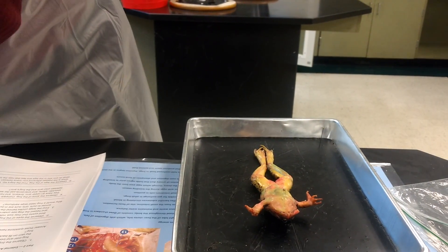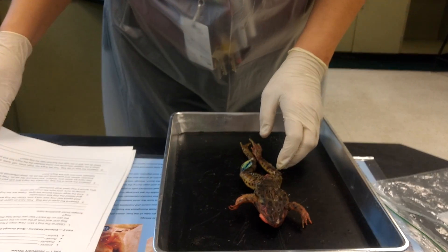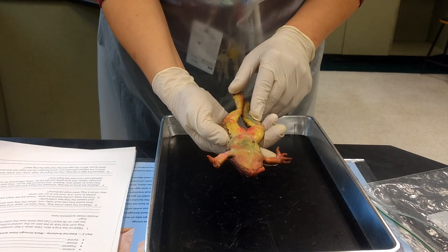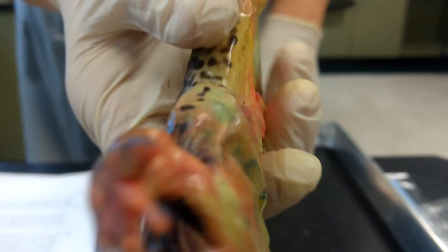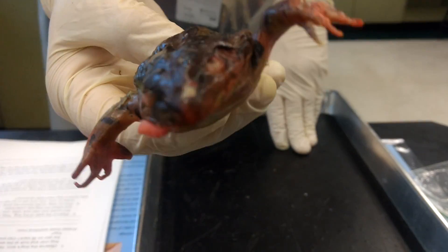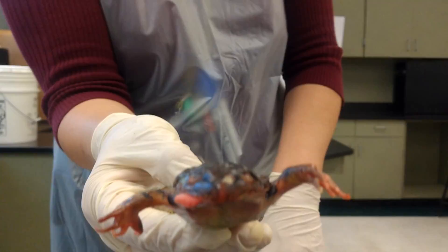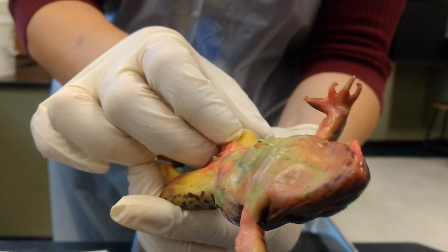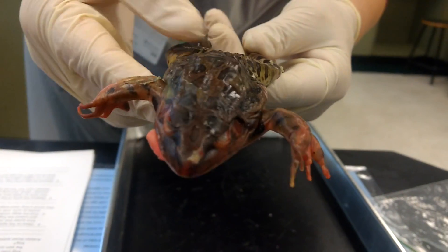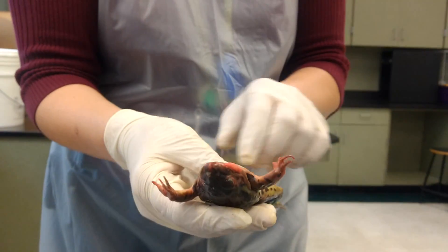Before we even go into the mouth, make sure you close up the bag it's in. First, we're going to observe the skin — what does it look like? Write something down about that on number one of your external anatomy packet. You'll be able to add to this when you get to touch it with your gloves on.